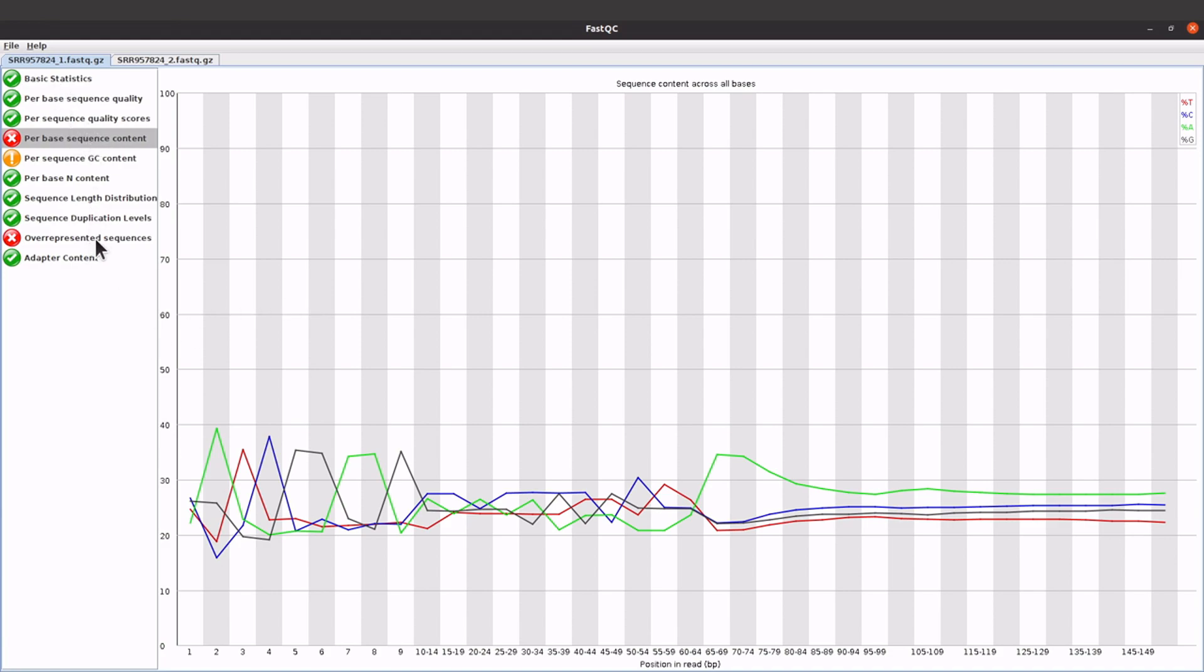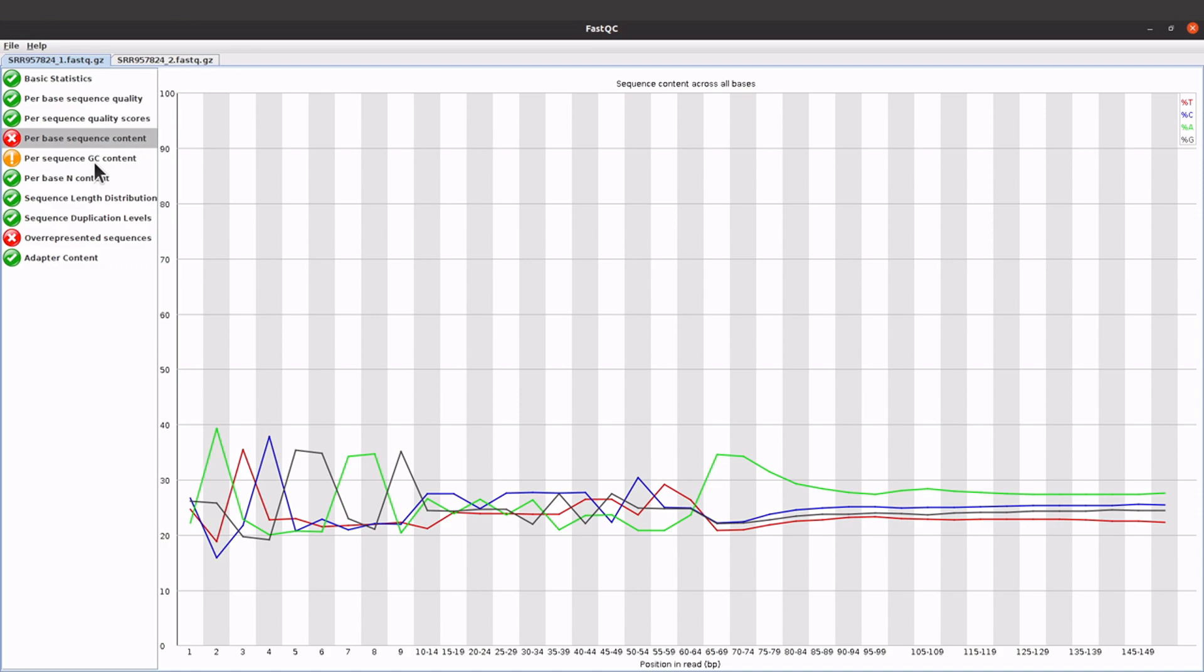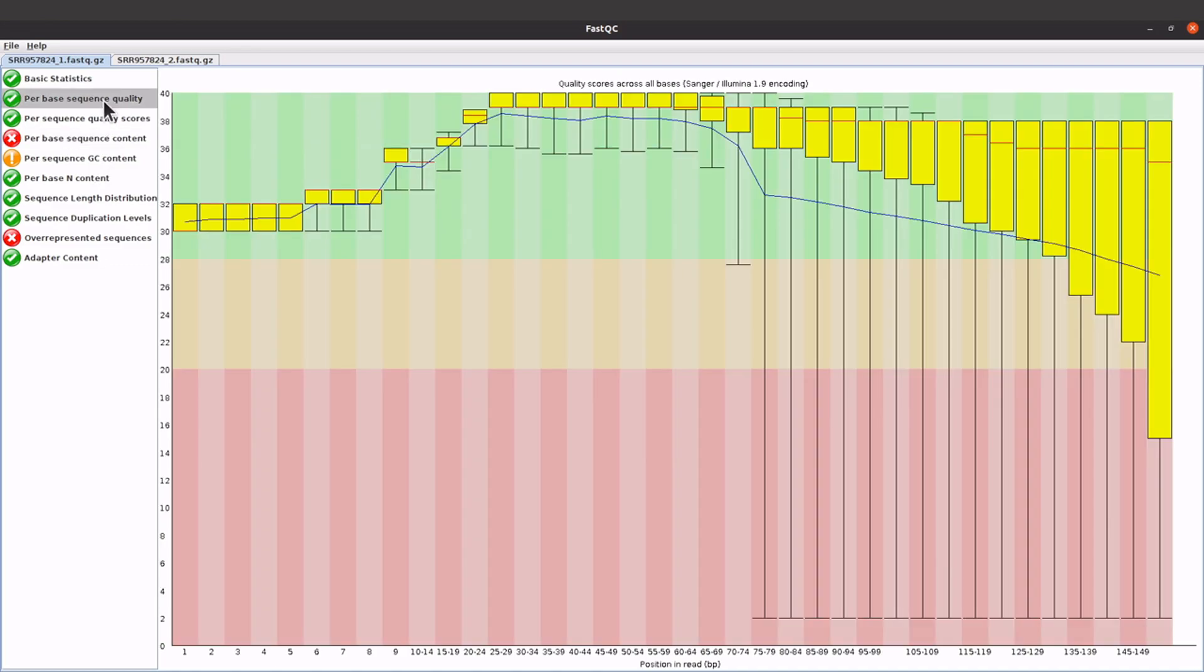FastQC will raise this alarm for you by giving this color here, so you just have to check and see what has happened. Of course, sometimes it can be red but it doesn't mean something is wrong. You just have to understand your data, and then that will help you to really confirm if something is wrong or not.